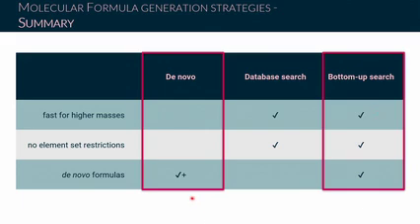So you will get de novo formulas for your given element set, and additionally also bottom-up formulas with elements that are not in the element set. But I think the take-home message here is the default is that we combine de novo with bottom-up, and then you have the choice between these strategies or the combined strategy.